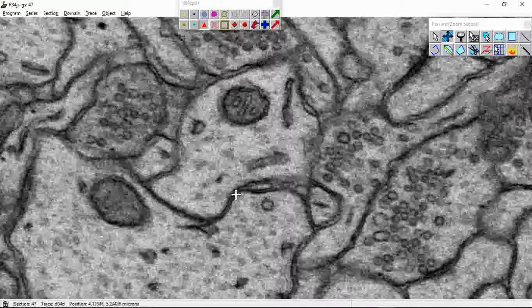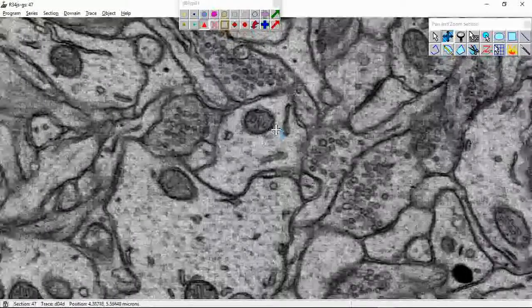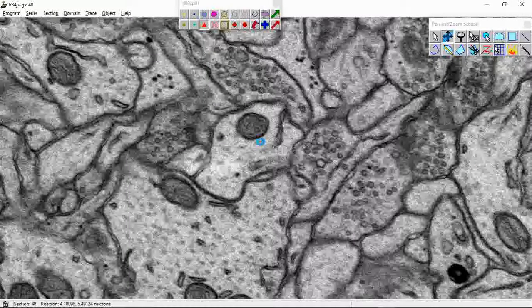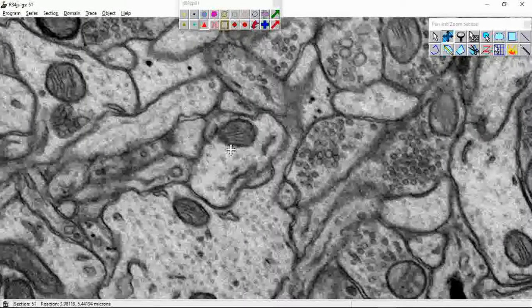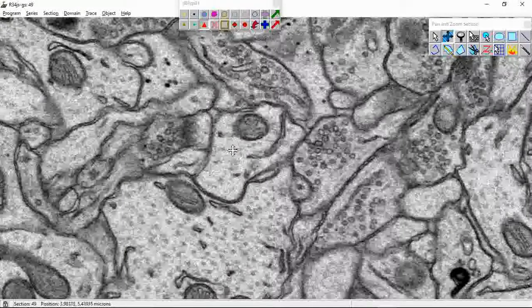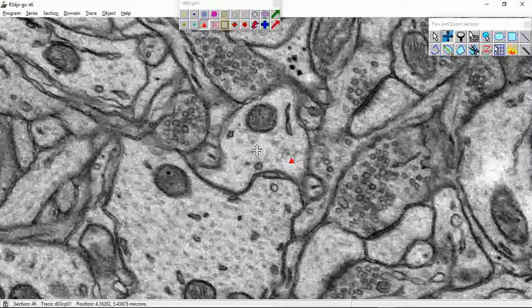And sometimes I found for me that this causes me to miss a protrusion, so I just like to keep a decently zoomed out view and scroll through the entire series, marking down protrusions. Now I'm going to scroll back because I actually did not stamp a protrusion. That was after the first protrusion I stamped. So some protrusions are easier to see than others.